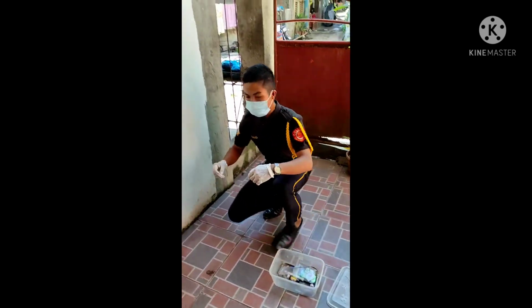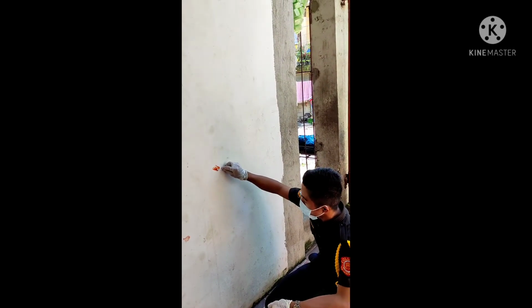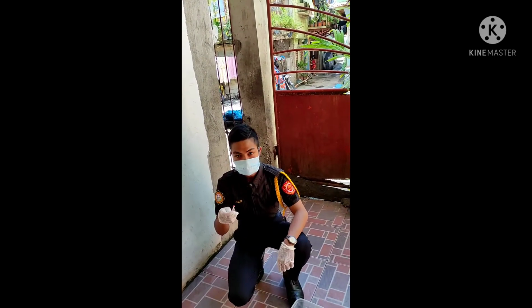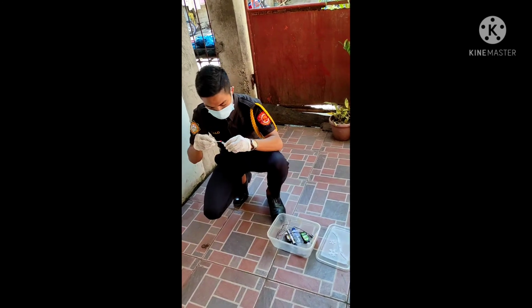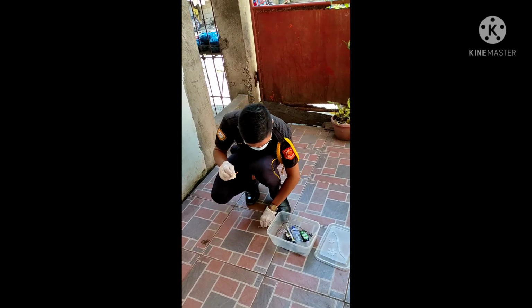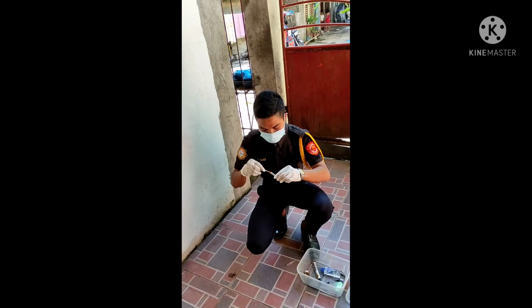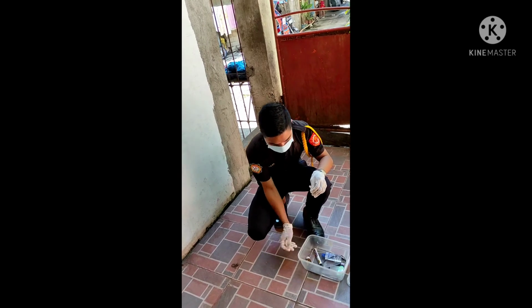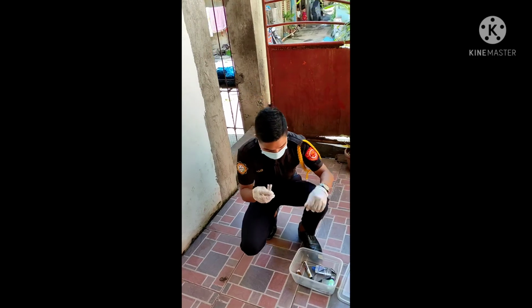I'm going to collect a blood stain by using cotton buds. Then I will put this one in a tube. Then the next is I'm going to seal the stain.